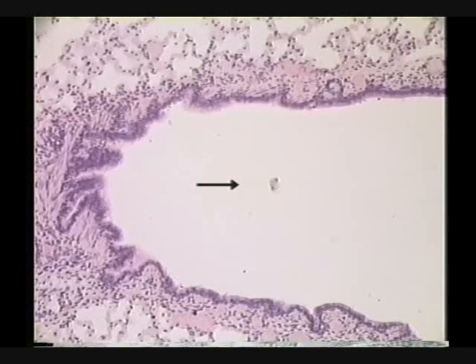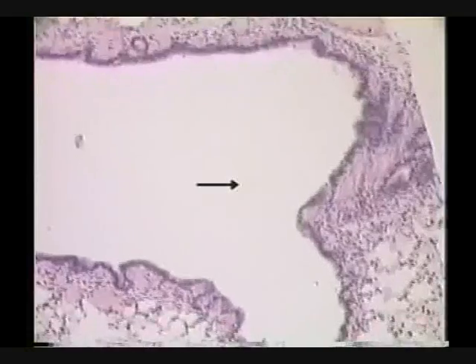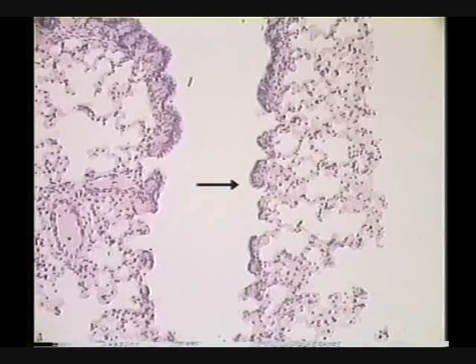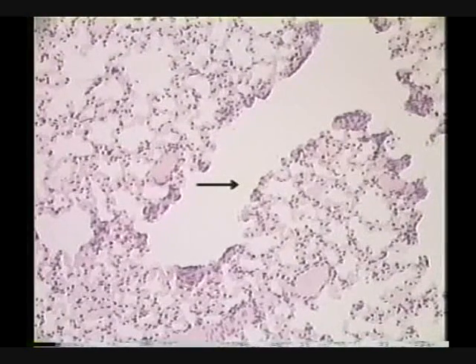So respiratory bronchiole signifies there's some alveoli along the side. In fact, we followed this one. When I saw this one, look, see, because I can follow it, follow this branch down. Now what are we in? Respiratory bronchiole. And follow it on down, and now what are we in? Alveolar duct.